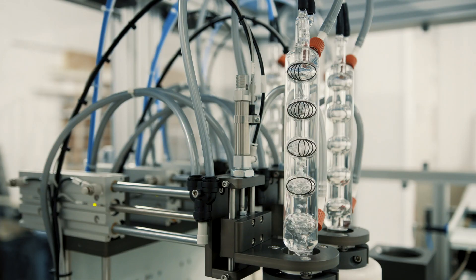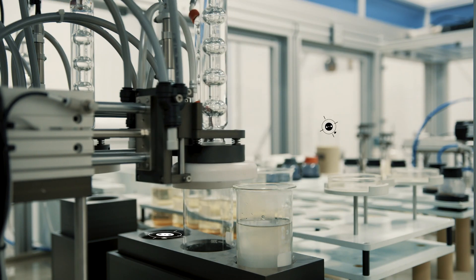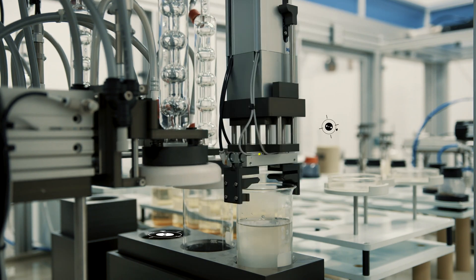A valued asset of your lab that keeps going 24-7, focused on the tasks at hand.